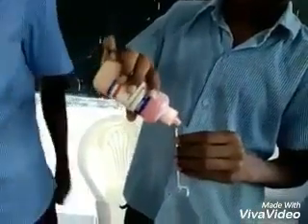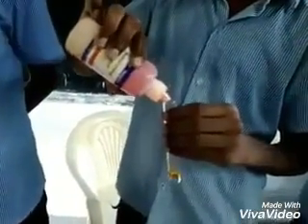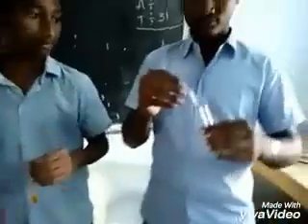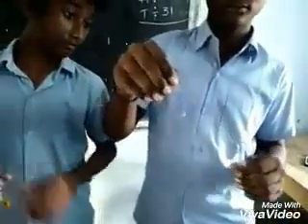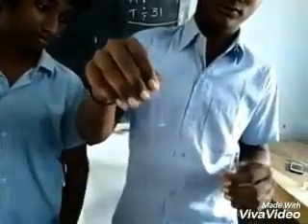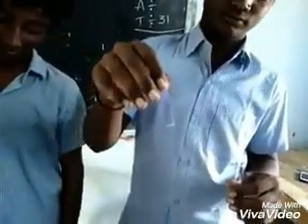The third student tests potassium hydroxide with methyl orange indicator — it turns yellow. The fourth student tests potassium hydroxide with blue litmus paper — it does not change color.